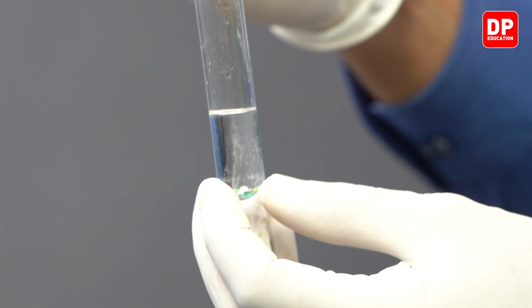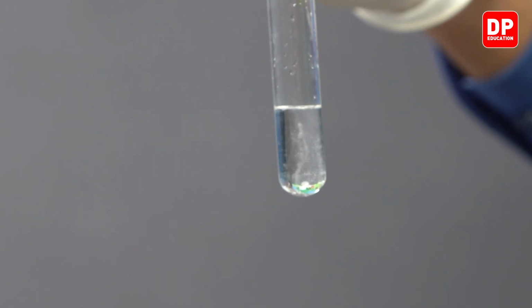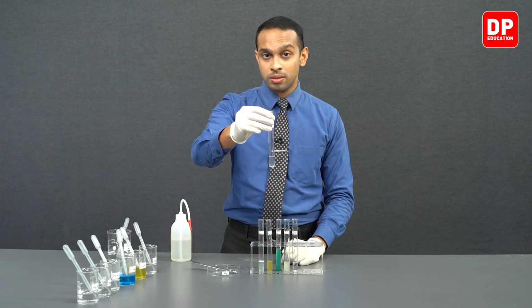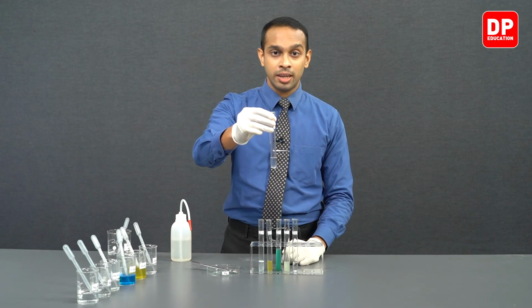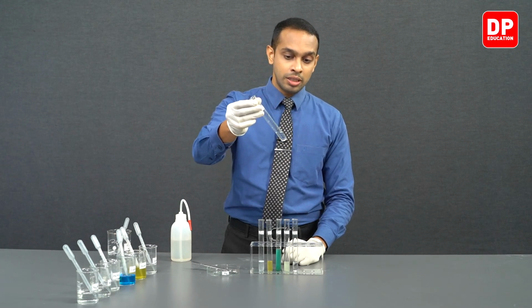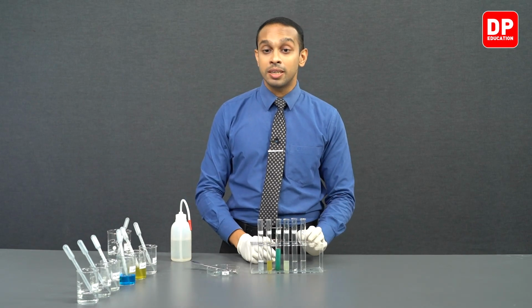The only reaction that you see over here is effervescence, or bubbling, around the magnesium strips that we added. This is because, students, when magnesium is added to water, it will react with water, even cold water. It will react slowly with cold water and will produce magnesium hydroxide and hydrogen gas. So that's the reaction that you observe over here, students. Other than that, there is no other reaction that is taking place here.